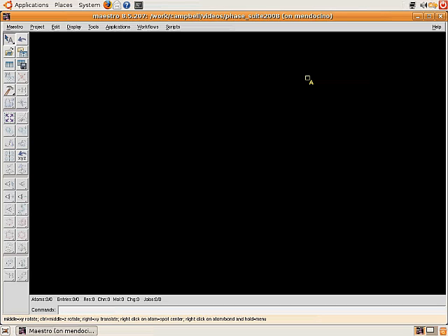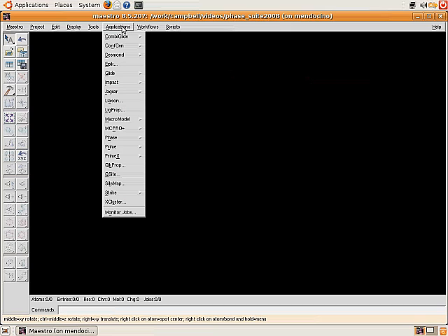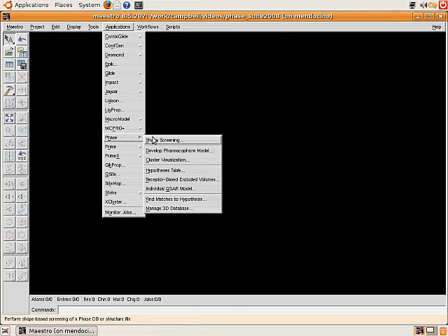The end goal of the pharmacophore development workflow is to identify a spatial arrangement of chemical features that confer activity toward a given target. The Phase interface is found within Maestro, which is the interface and visualization tool used for many different Schrödinger programs. To open the Develop Pharmacophore Model interface within Maestro, we head up to the Applications menu, find Phase, and choose Develop Pharmacophore Model, as you can see here. There are also other interfaces to various other Phase tools that we can open.